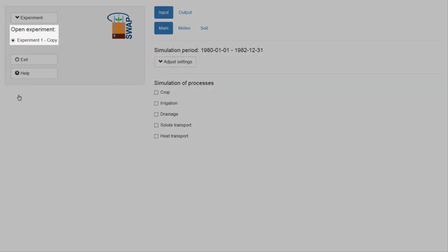Below Open Experiments, we see from the radio button list given here that the experiment, Experiment 1 Copy, is selected.